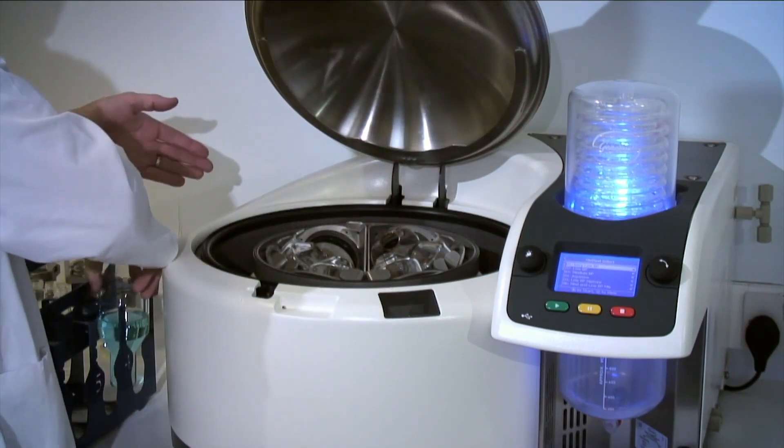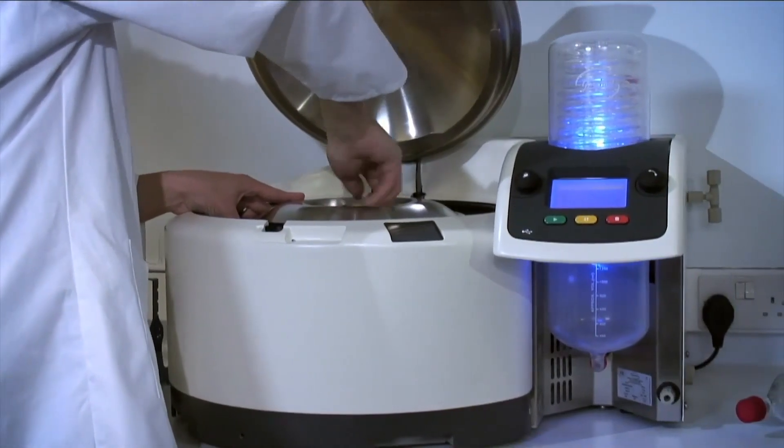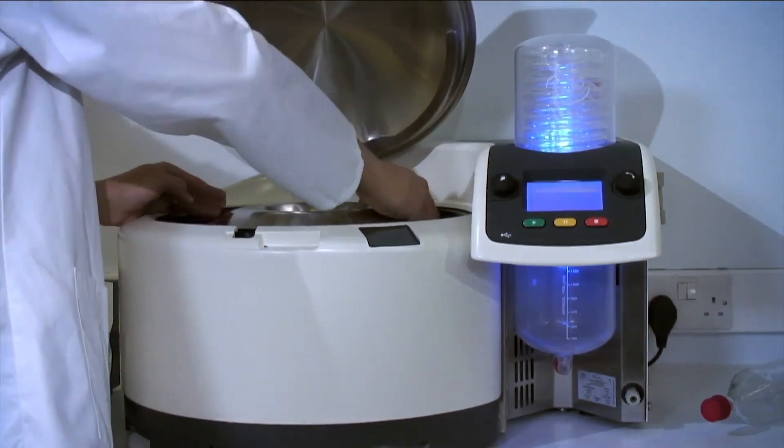Using the rocket is simple. Load your flasks or pucks of tubes into the rotor. Secure the inner lid. Check the water level.